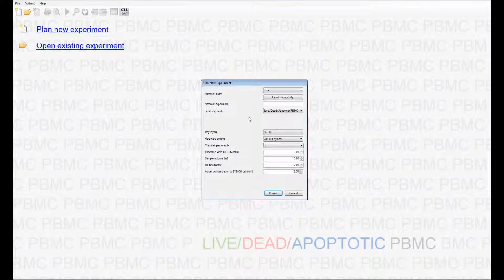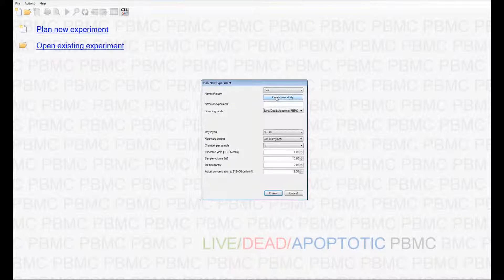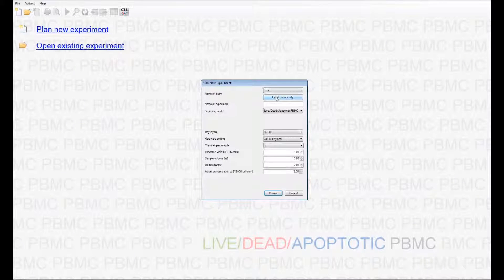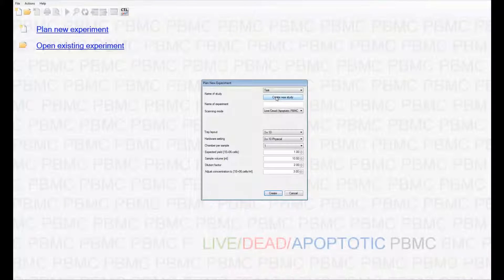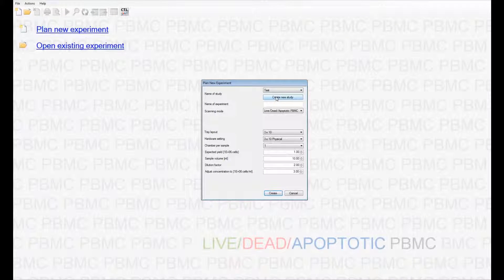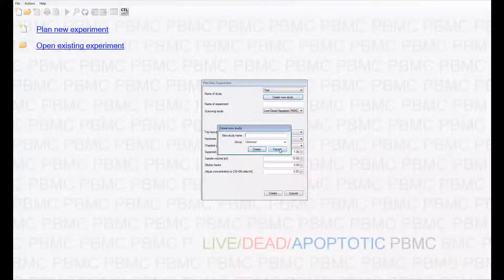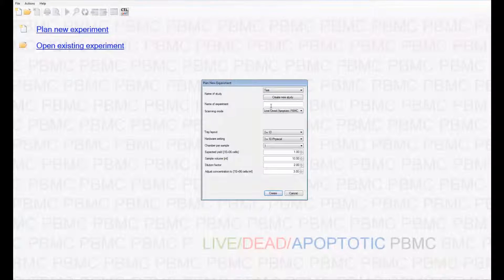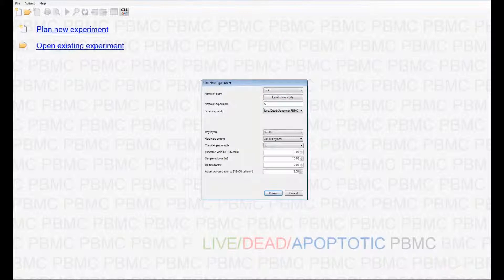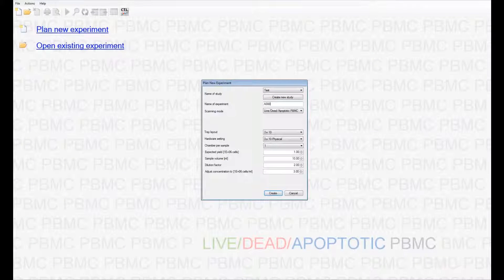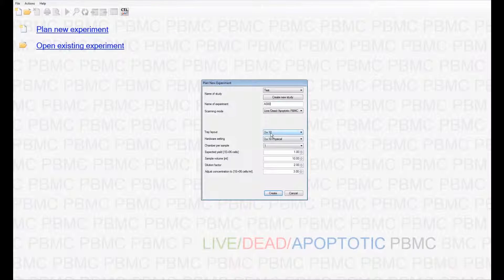If you would like to create a new study, you can click on the Create New Study tab and enter the name of the study. The experiment number is a unique identifier and cannot be repeated within the same study.